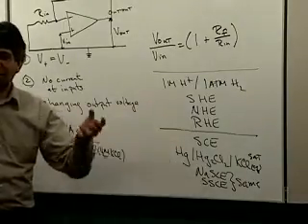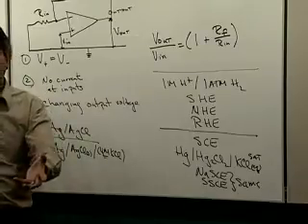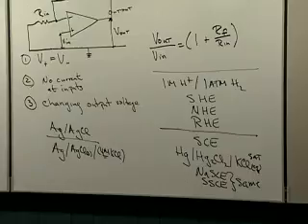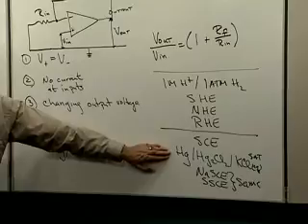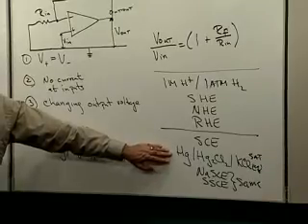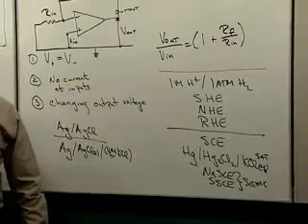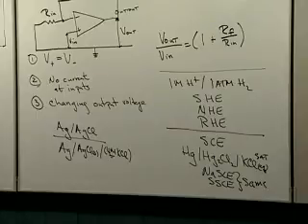And so in that condition, you can see even if you want to work, say, in a non-aqueous electrolyte and are concerned about water, if you can put up with 5 microliters of water in your cell, then you're still okay. Sometimes you can't even put up with that, but you can do that. If you need to have a lower leak rate, then there are these reference half cells that use a cracked glass bead. They've taken a tiny little glass bead, heated it up, thrown it in water, you get a thermal crack going through it, and the leak rate on that is ridiculously small. So if you're really concerned about intermixing, that's another way to do it.